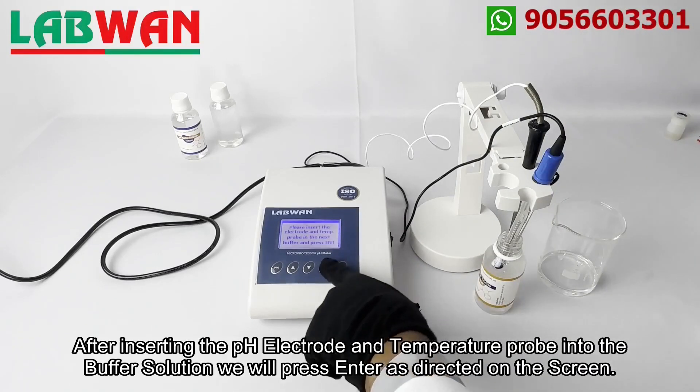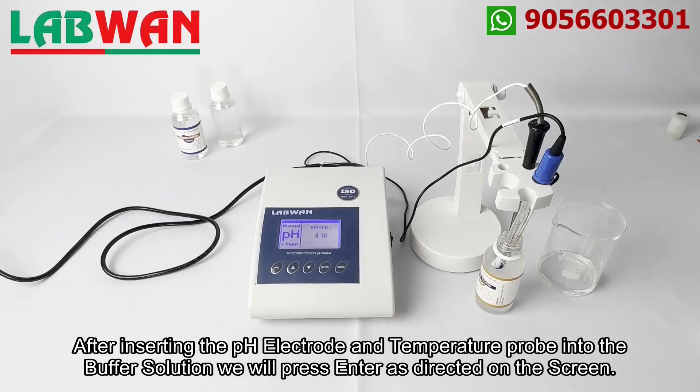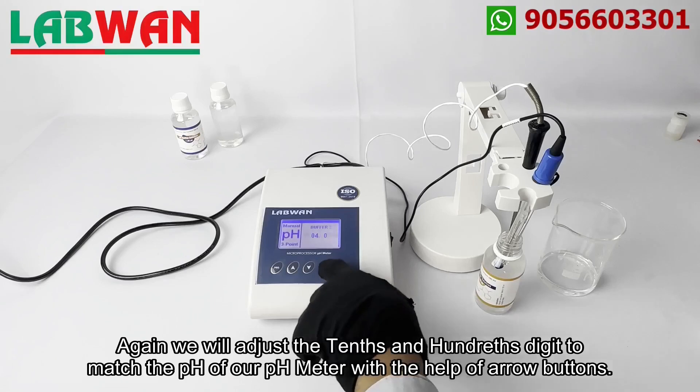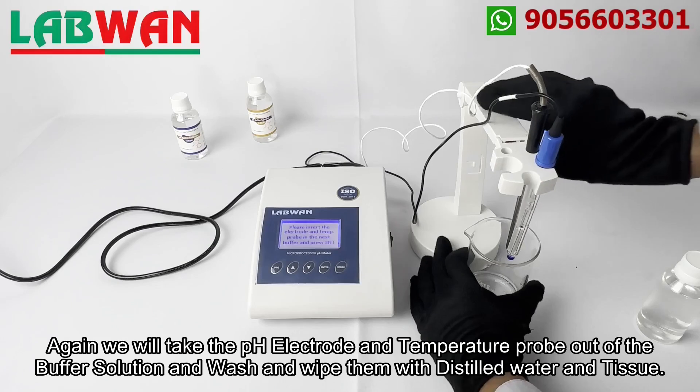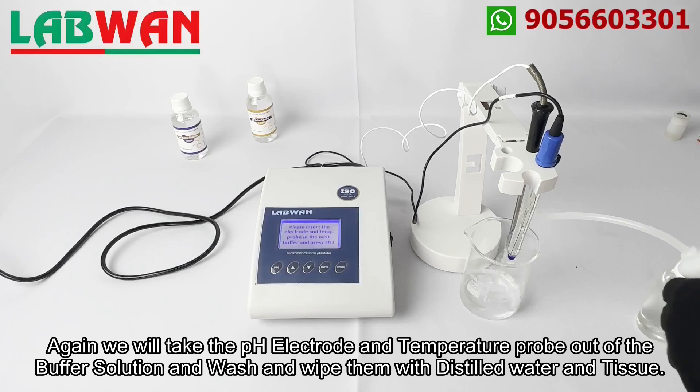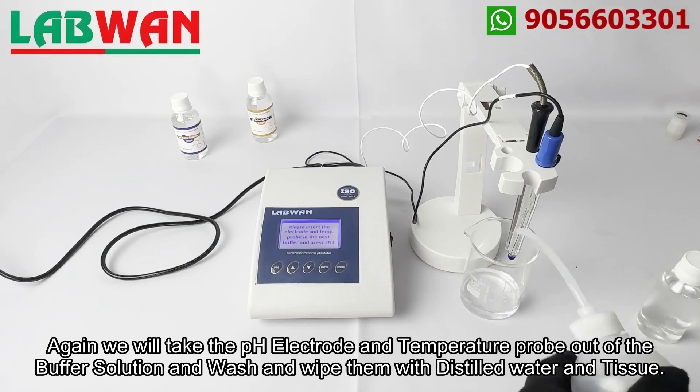After inserting the pH electrode and temperature probe into the buffer solution we will press enter as directed on the screen. Similarly as the first calibration, the tens digit will start blinking indicating it can be adjusted, and as our pH buffer is 4 pH we will skip the tens and ones digit by pressing the enter button as they match with the pH of the buffer solution. Again we will adjust the tenths and hundredths digit to match the pH of our pH meter with the help of arrow buttons. Again we will take the pH electrode and temperature probe out of the buffer solution and wash and wipe them with distilled water and tissue.